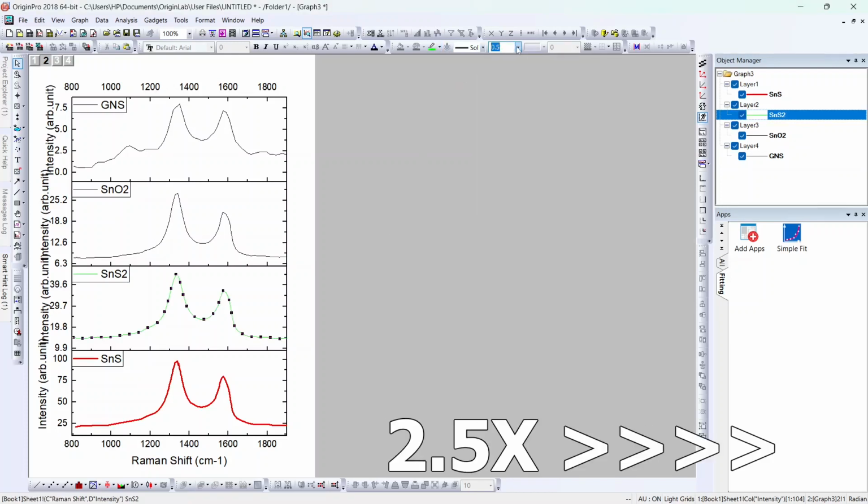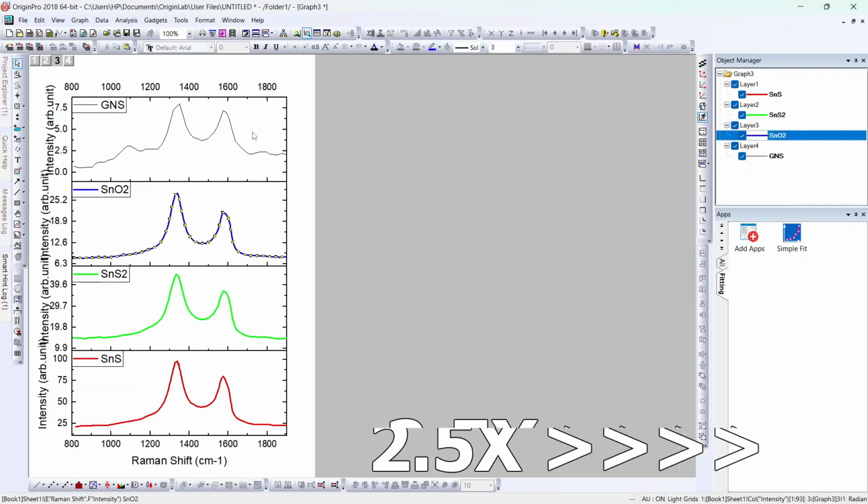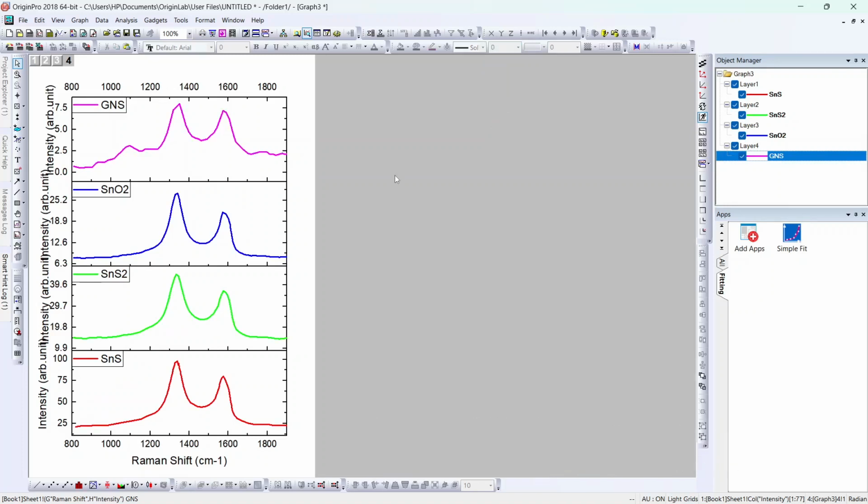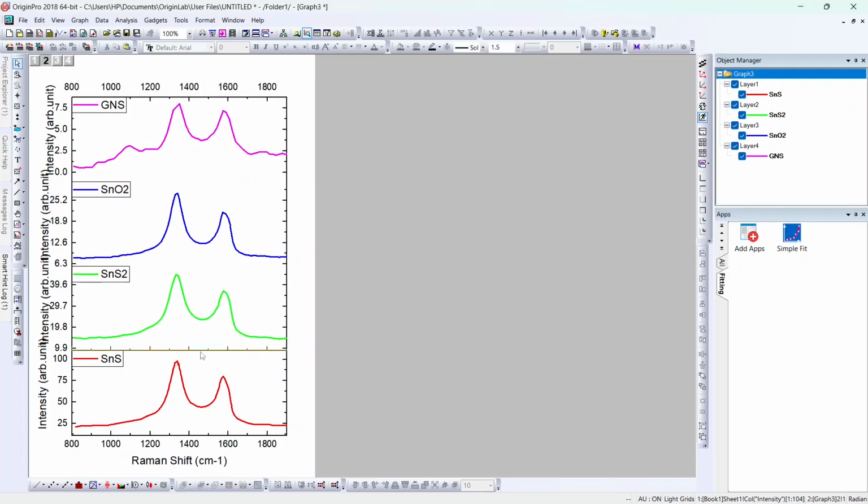Now this is on a common x-axis, so we don't have to put the x-axis everywhere. So let's select and delete, select and delete, select and delete, and another, I don't want to show the scale on top, so let's select it and delete.